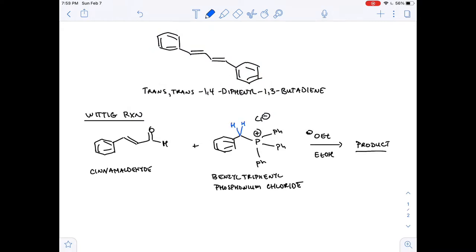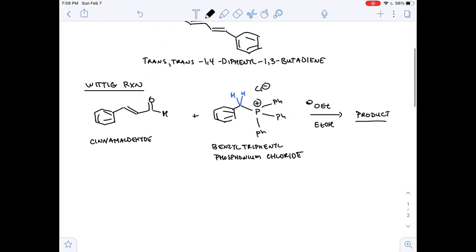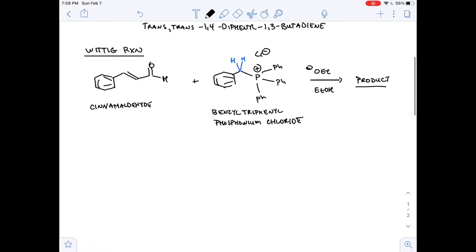Take a look at these benzylic protons right here. Those are very acidic, especially being a benzylic position, but also next to that phosphorus that's positively charged. The ensuing conjugate base is resonance stabilized, and so sodium ethoxide is sufficient to remove that proton at the benzylic position. Now that base is usually something called butyl lithium, and it's much stronger, but in this case, it's perfect for us because we don't want to work with butyl lithium because it's pyrophoric.